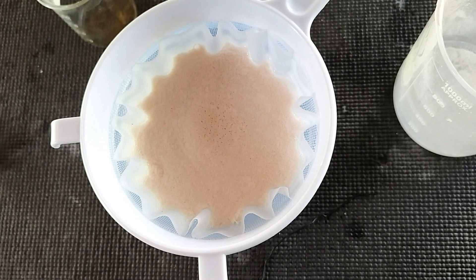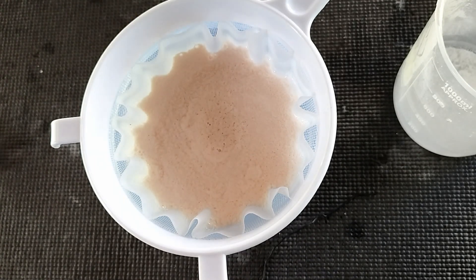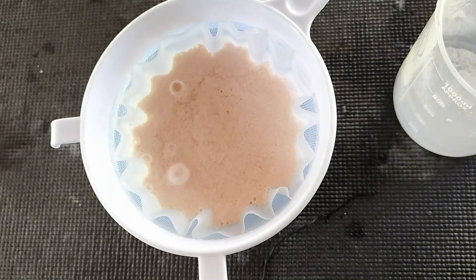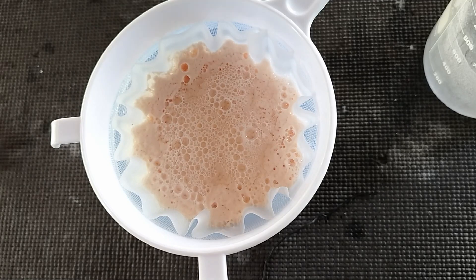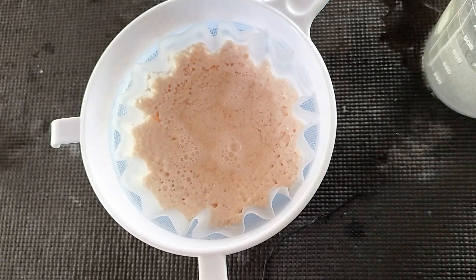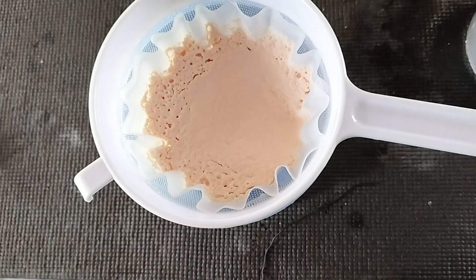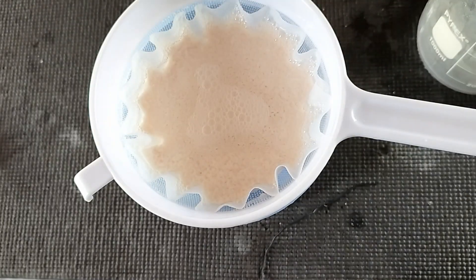Something about manganese carbonate being generated just looks alive. To ensure fewer contaminants end up in your final product, it's good to wash this several times.